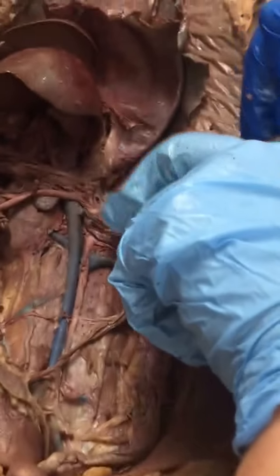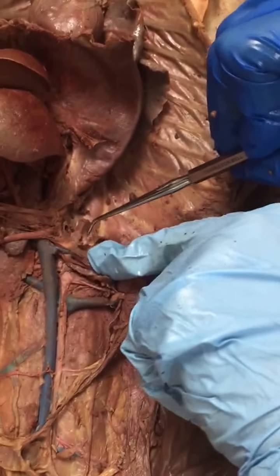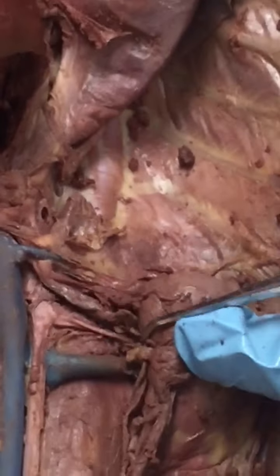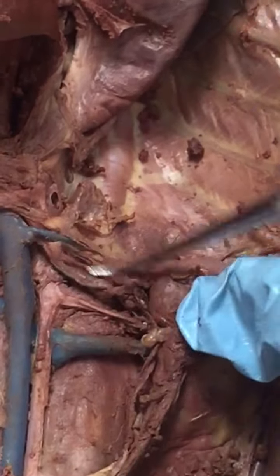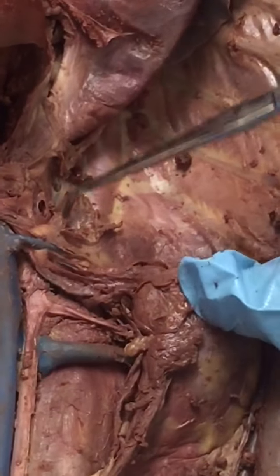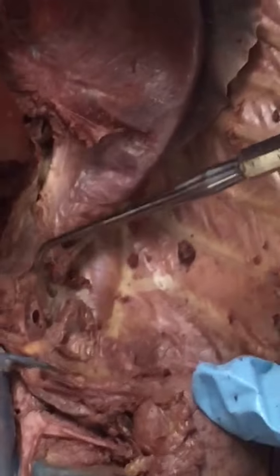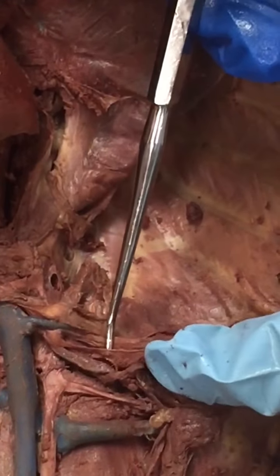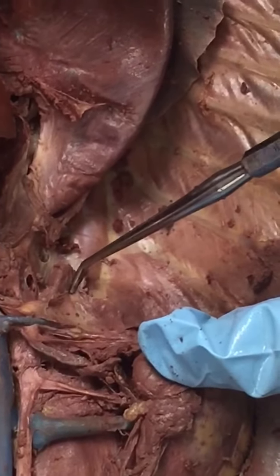There's also one tiny little one right here called the posterior phrenic. Okay, so the adrenolumbar and the renal both run parallel to each other and perpendicular to the dorsal aorta, but the posterior phrenic runs parallel to the dorsal aorta here and perpendicular to the adrenolumbar here, and actually runs underneath it. Okay, so that little guy's posterior phrenic.